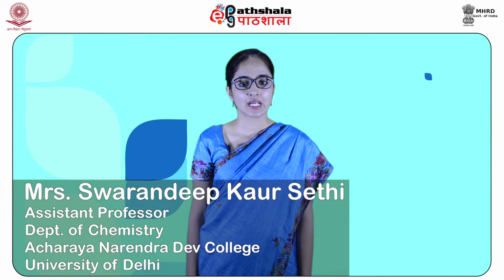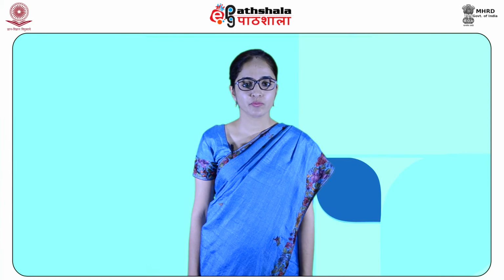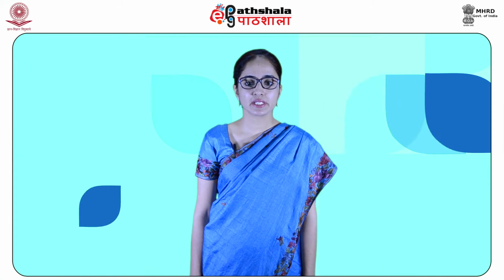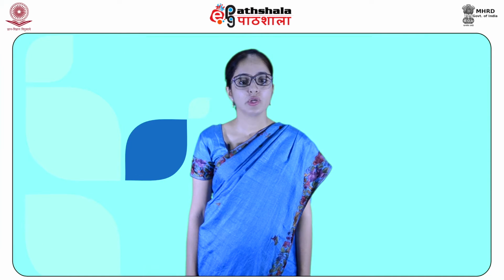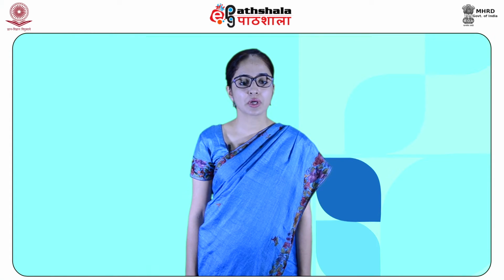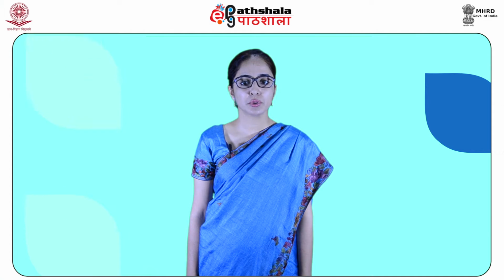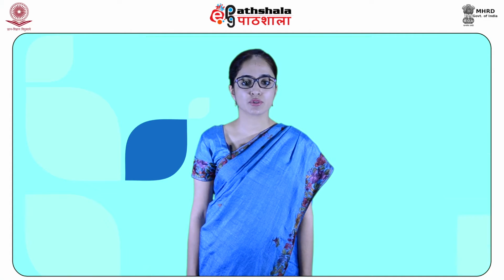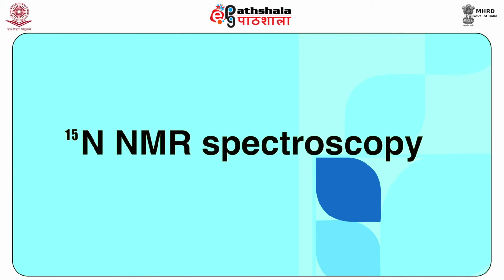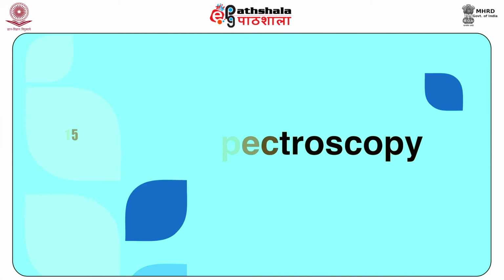Dear students, after studying this module, you shall be able to understand the basic concept of nitrogen, fluorine and phosphorus NMR, know about the internal and external standards to record these spectra, know about the heteronuclear coupling between nitrogen, fluorine and phosphorus atoms. Now students, let us begin with the 15 nitrogen NMR spectroscopy.